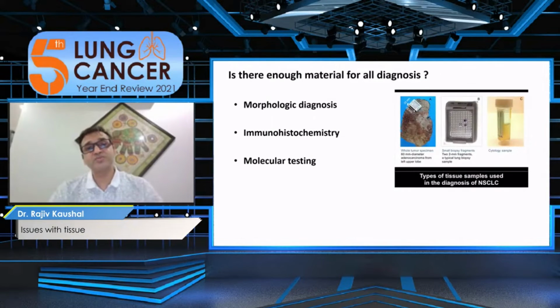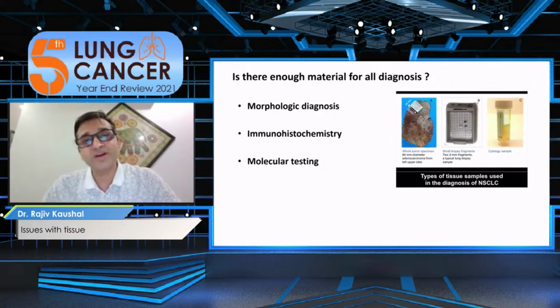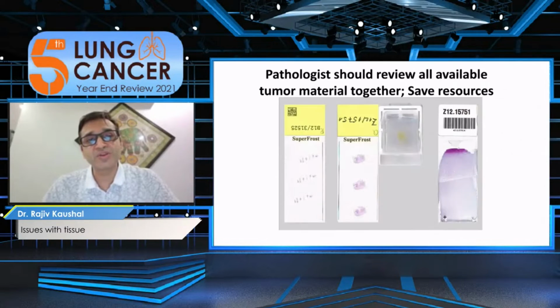And this information should be communicated to the laboratory person. Once the tissue is processed and slides are made, now the role of the pathologist comes, and we use this tissue not only for the morphological evaluation but also for the IHC and molecular workup.